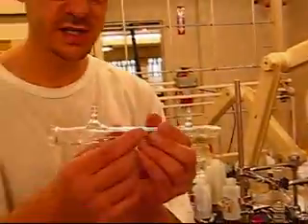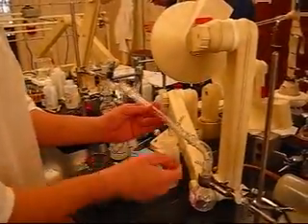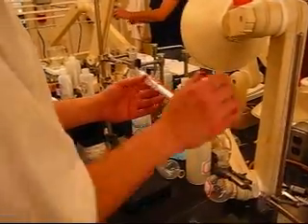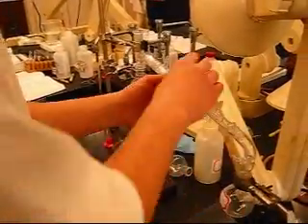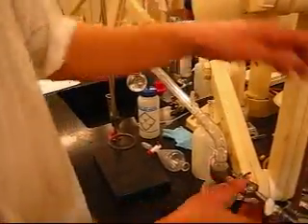This here is our distillation column. This is going to be cooled by water running through, and that will condense the evaporation. So now we have that set up.